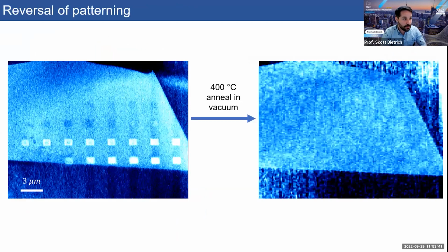One interesting thing that we'll note is this phase transition is reversible. You can see a flake here that has quite a few doses on it. I think we were doing 28 on this one over the full spectrum, and we were testing the stability of this.